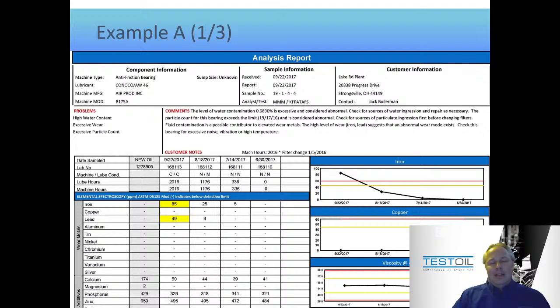But at the end of the day, yes, when the human says, I think we should make a comment about wear metals, it is a pre-written comment. And why I mention this is one of the most frequent complaints that I receive regarding how reports are laid out. People always have an opinion as to what data should appear first or whatnot, but the most common thing they complain about is the comments.